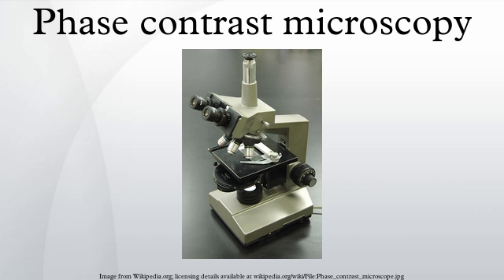Traditional phase contrast methods enhance contrast optically, blending brightness and phase information in a single image. Since the introduction of the digital camera in the mid-1990s, several new digital phase imaging methods have been developed, collectively known as quantitative phase contrast microscopy. These methods digitally create two separate images, an ordinary bright field image and a so-called phase shift image. In each image point, the phase shift image displays the quantified phase shift induced by the object, which is proportional to the optical thickness of the object.